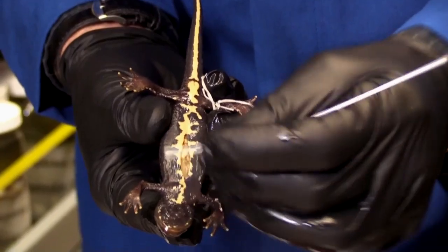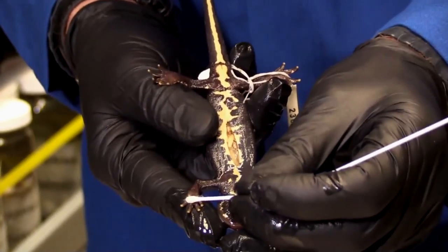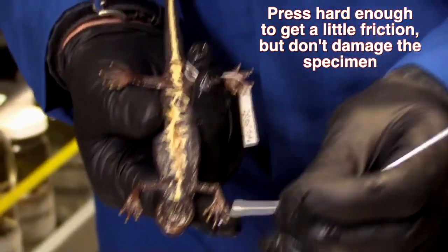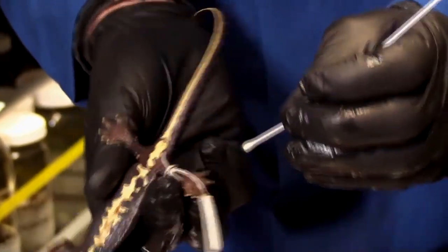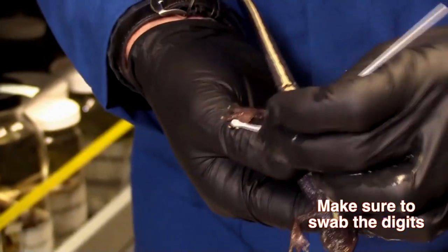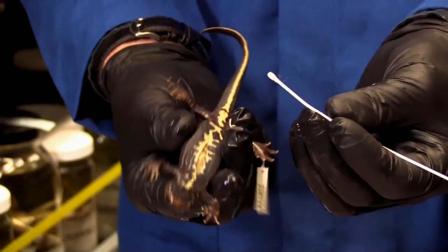I want to be especially careful — I'm not going to swab the tail because I don't want it to break off. You don't want to do it too hard; you do not want to break the skin of the specimen. You want to be gentle, but vigorous enough to get little pieces of tissue coming off. Now I'm going to do the last few strokes on the toes, because we know that's an area where the chytrid fungus tends to be more commonly growing, even at low concentrations. That's about 30 strokes, maybe a few more.